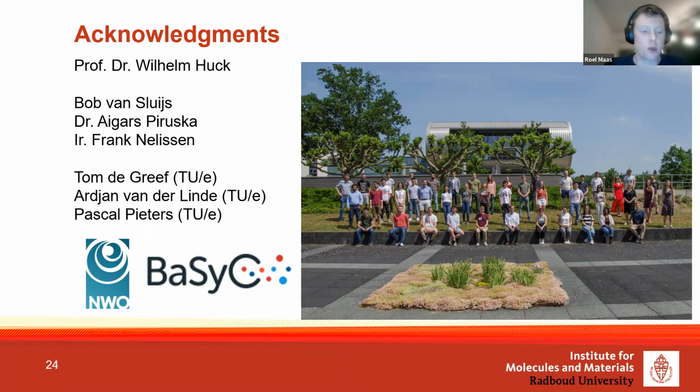Yeah, so I think also when you would choose, for example, lysates of E. coli, there will be differences because there is always a batch-to-batch variation. And at the moment, with the library we have now, the amount of experiments, I don't think we have enough data to make the same predictions when we use this network in a different system or a different extract, or maybe PURE, for example. But I think with this method, when you include more and more experiments and also start including experiments of different lysates, it maybe will be possible to also detect the differences between the lysates and pinpoint specific areas of why one lysate is better than the other, or what the difference between them is.